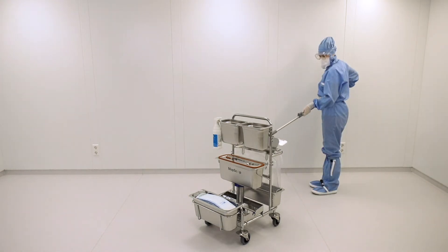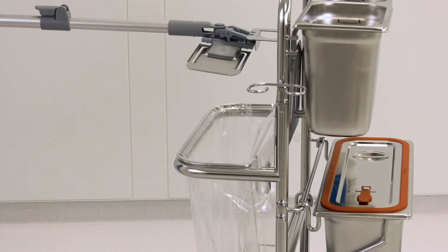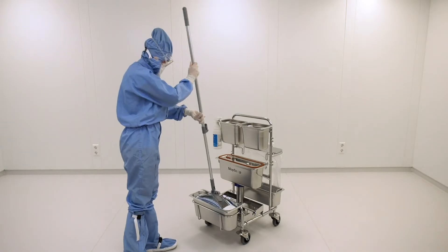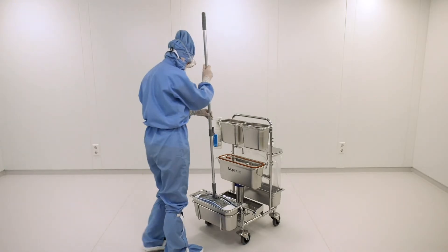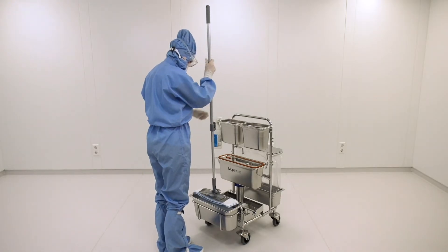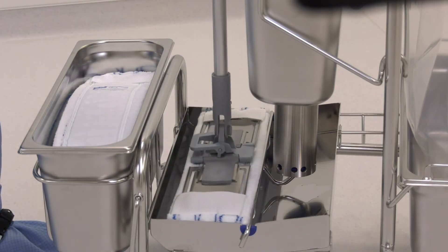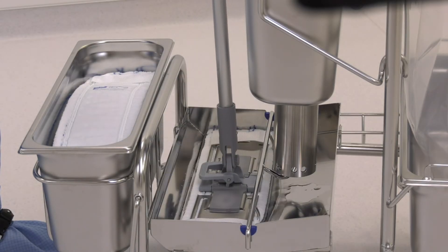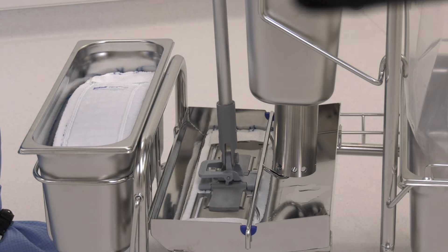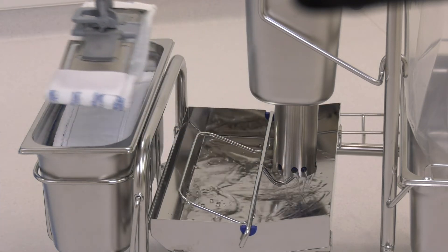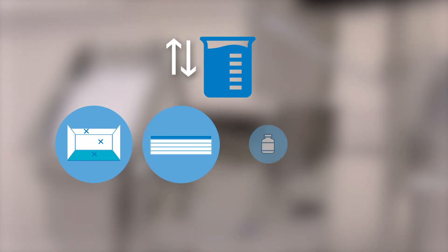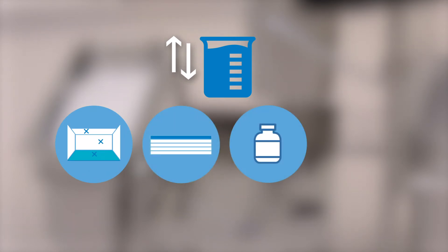Now, open your mop frame touchless to pick up a clean mop cover. To prepare your mop textile for the disinfection process, soak the mop cover with a predefined amount of liquid. In this example, a reusable microfiber mop is soaked with a liquid quantity of 400 milliliters. The quantity you should use always depends on the area of use, textile, chemistry, and floor.